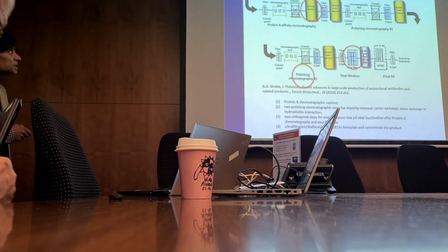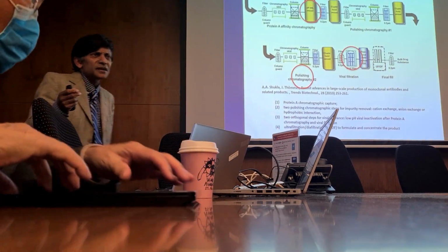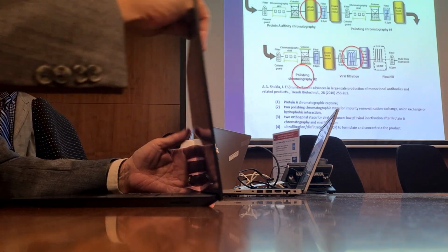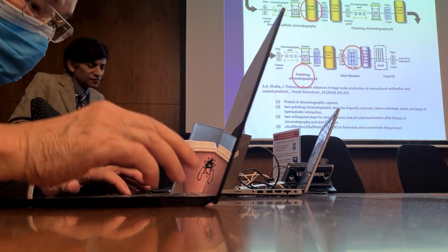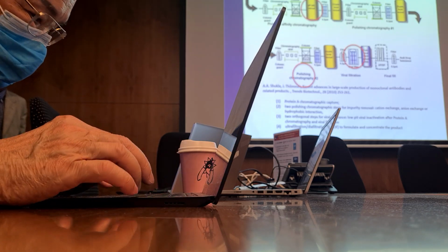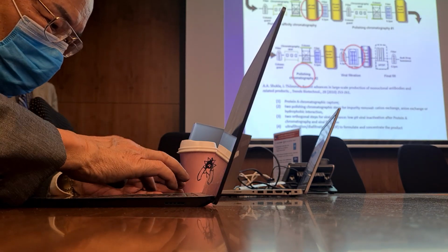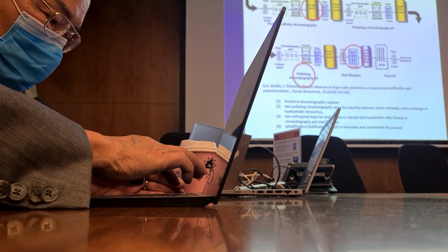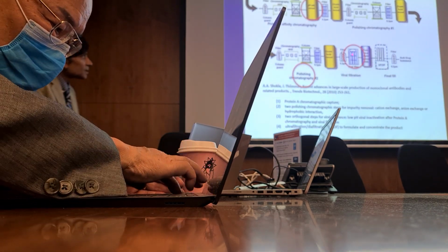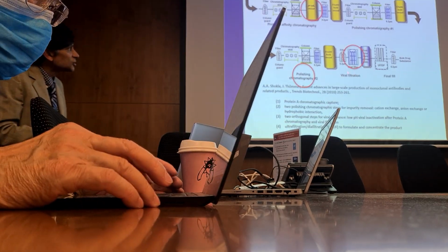And so pH adjustment means you will reduce the pH to a lower value, about 3.5, something like this. If the product is stable, that inactivates retroviruses. Polishing chromatography typically uses anion exchange membranes. You can adsorb the contaminant, adsorb the virus particles, and the monoclonal antibody flows through. You need a different isoelectric point to make that work. But we are talking about virus filtration. So these are, if you like, large pore ultrafiltration membranes.